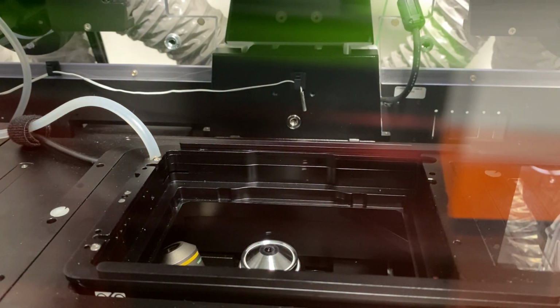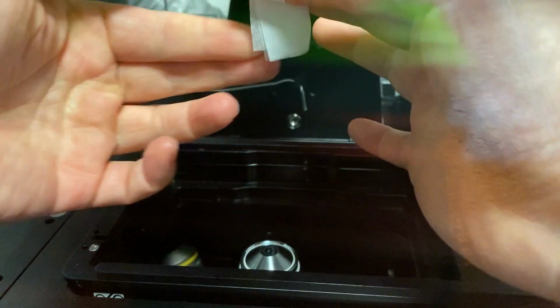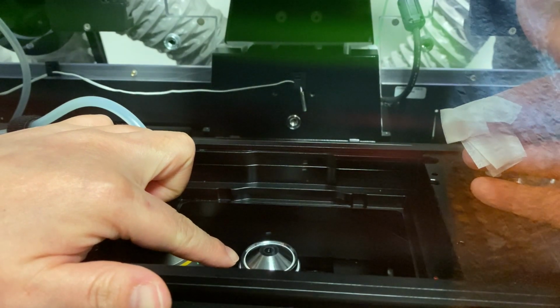And then finally, with the dry lens tissue, you want to dry off. If you find that some oil has dripped down the side, please clean those up also.